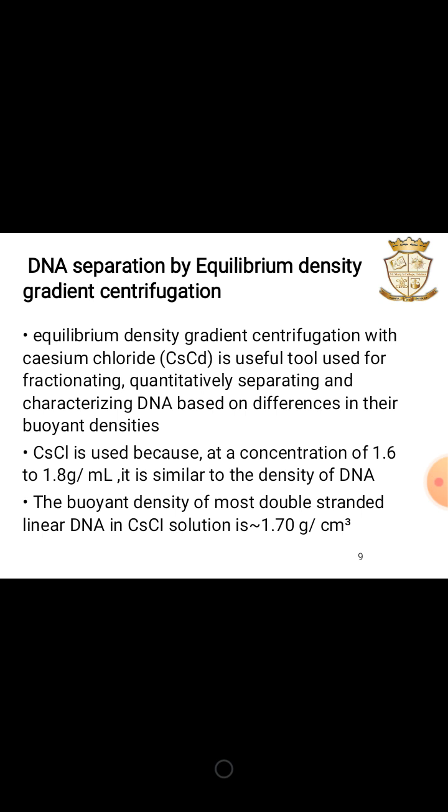DNA separation by equilibrium density gradient centrifugation. Equilibrium density gradient centrifugation with cesium chloride is a useful tool used for fractionating, quantitatively separating and characterizing DNA based on the difference in their buoyant density.